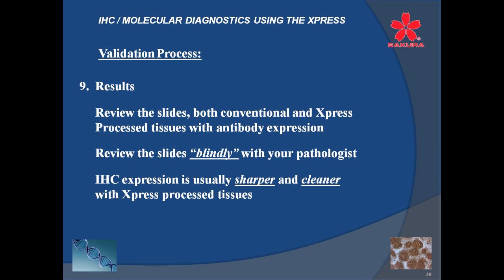And then the IHC expression is usually sharper and cleaner with Xpress processed tissues. Now, why is that? Well, there are several reasons. Now, all this is dependent, in your validation, on the section thickness having been maintained as what we tried to standardize, which is about 2 millimeters, if that's what your choice is.